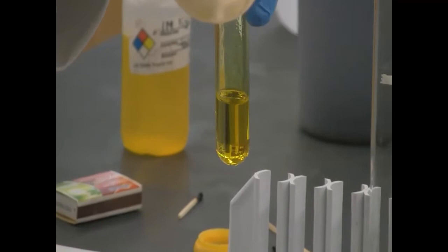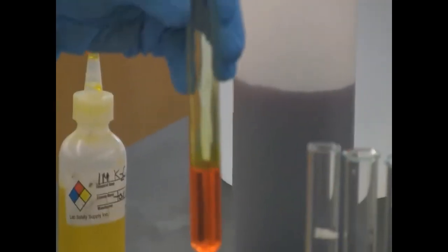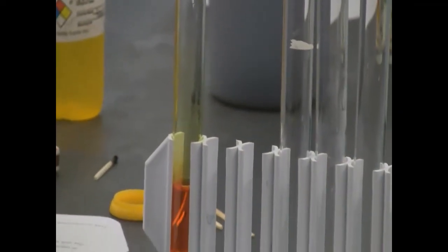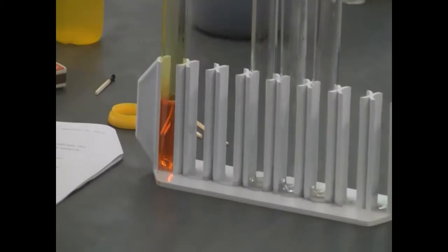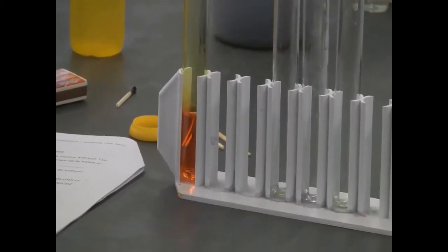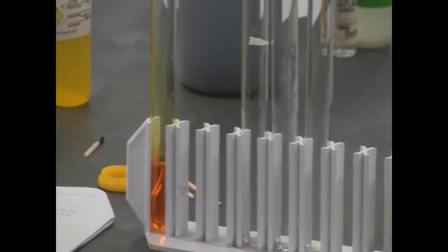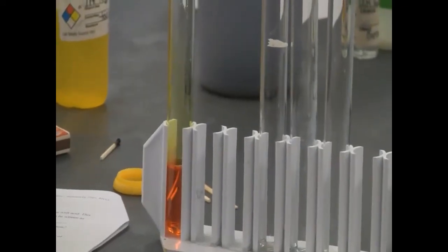Yeah, you can see that in the equilibrium we need acid. Several drops, you can see the color. Now, I'm going to add 6 molar sodium hydroxide, NaOH, to this reaction, and you're going to check the shift of the equilibrium.